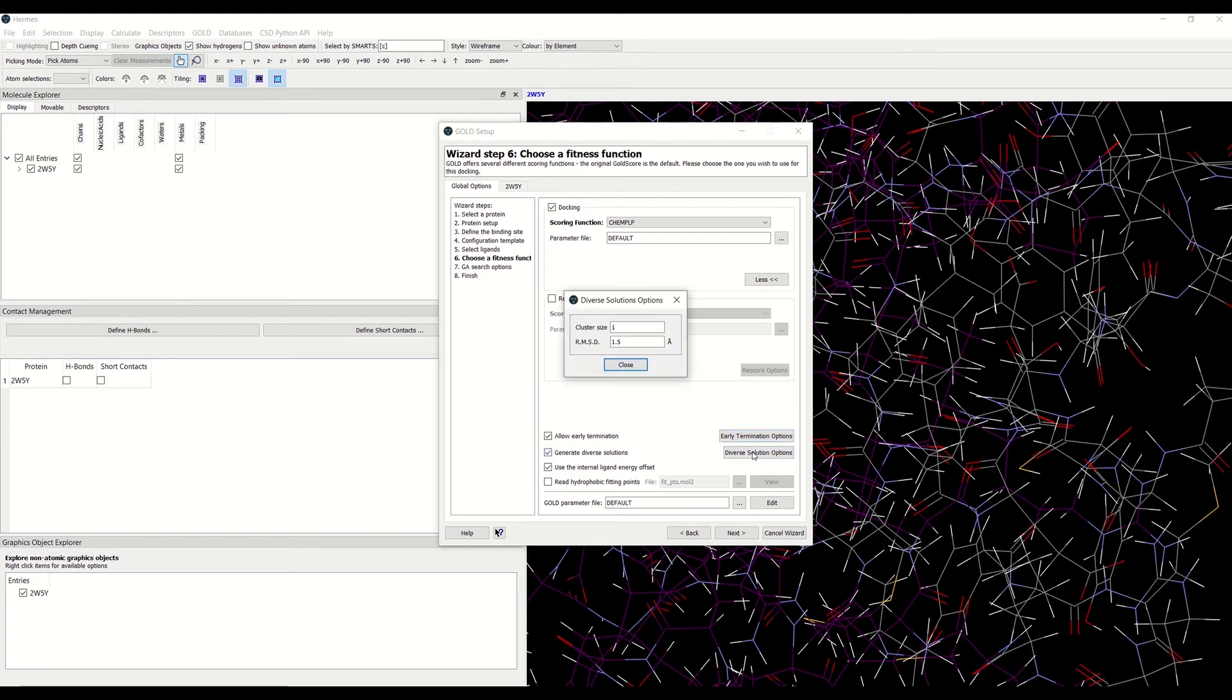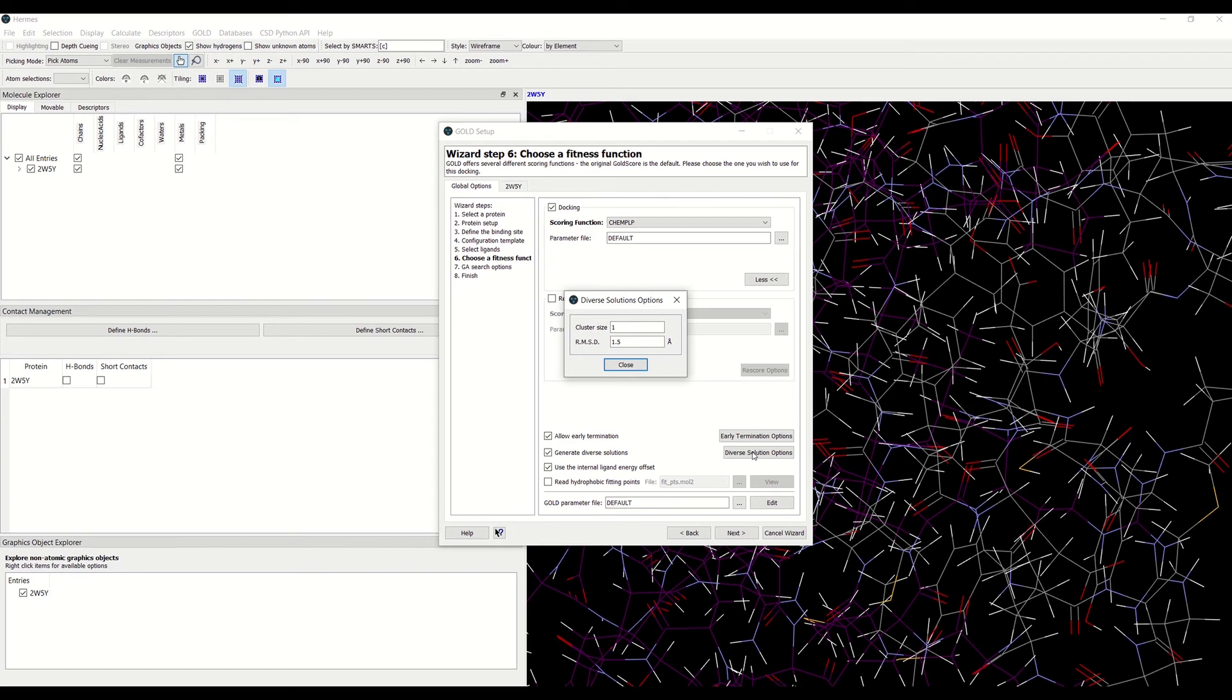You can specify the cluster size. The default is 1. You can use this to specify how many diverse solutions are contained in a cluster within a user-defined RMSD.